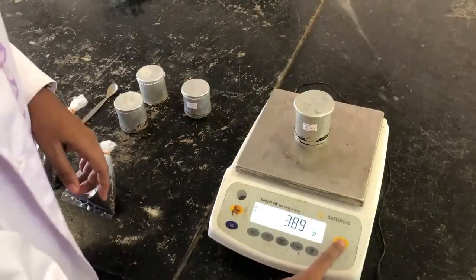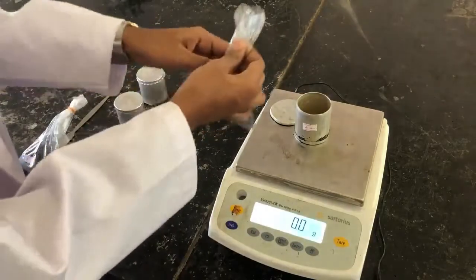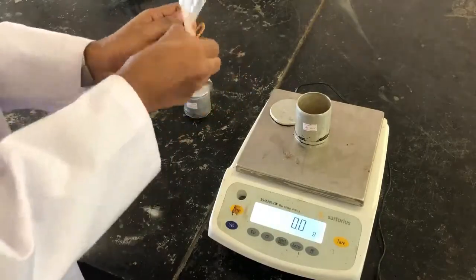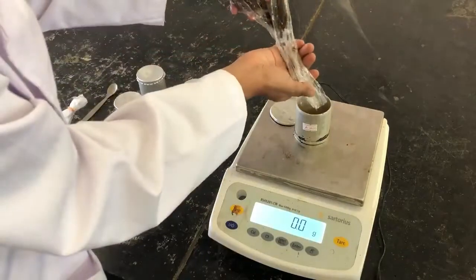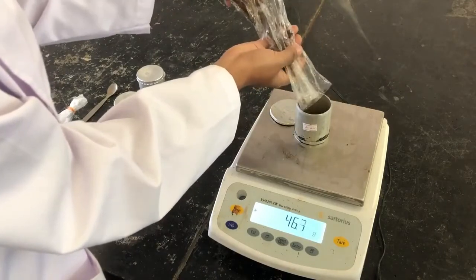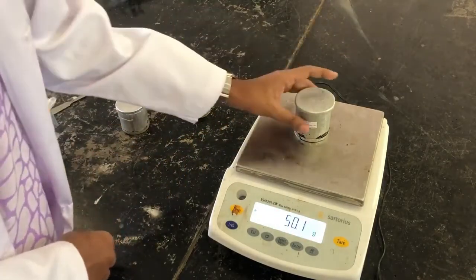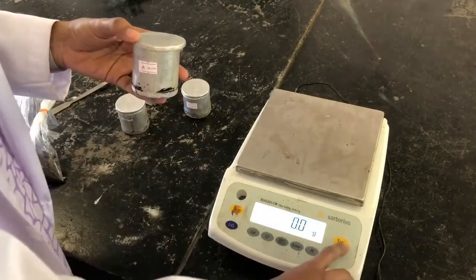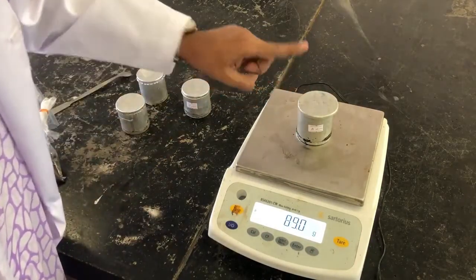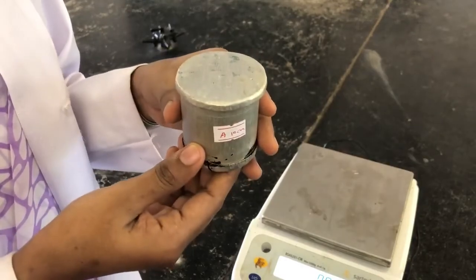Now I am going to set this device to zero because we are going to measure exactly 50 grams of soil sample. That is to determine the soil moisture content. Now we have taken exactly 50 grams of soil sample. When you measure it, the weight obtained is the weight of the empty moisture can plus 50 grams of soil sample that we have obtained. Now we have to oven dry this soil sample to measure the moisture content.